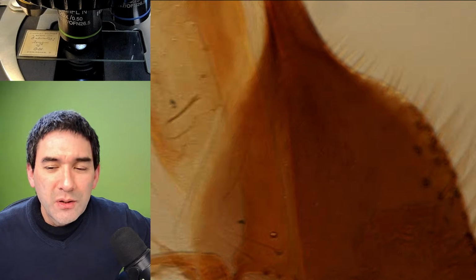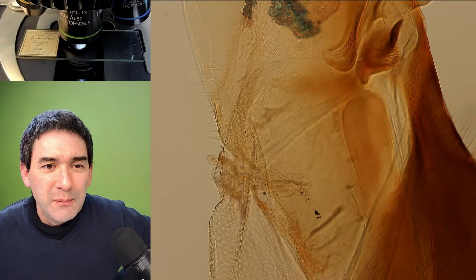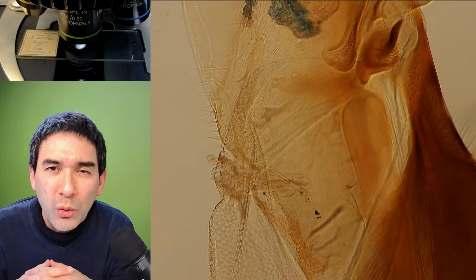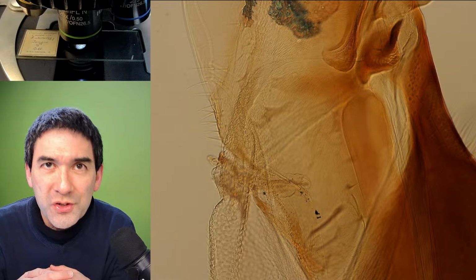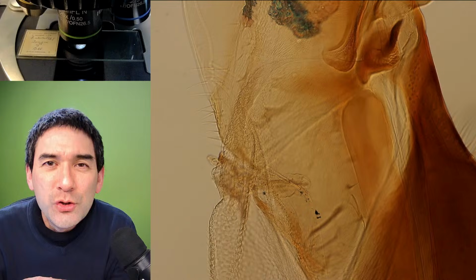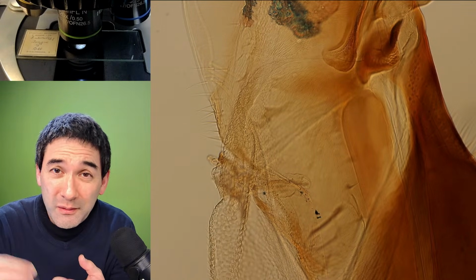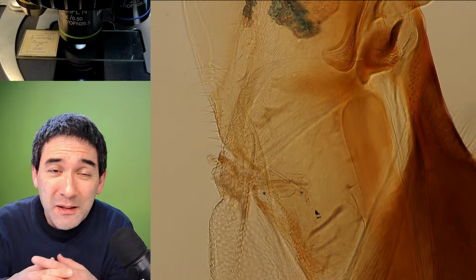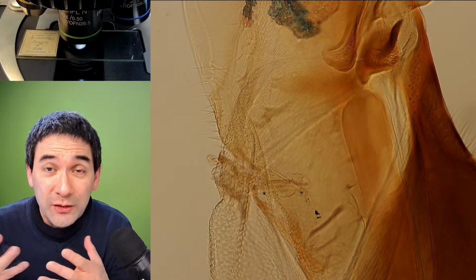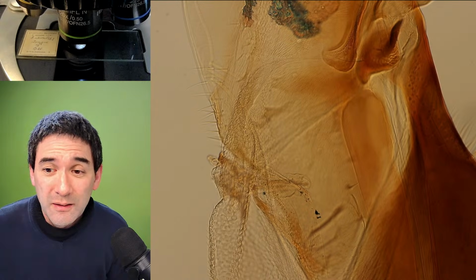It's actually quite interesting because we were talking about some of the more toxic chemicals used in biology. There used to be a solution called Hoyer's solution, and this was used as a so-called clearing agent. Basically, if you had very dark and dense specimens, you added this solution, and it kind of cleared the specimen. There's only one problem: this solution was very toxic and acted like a drug. However, back in the 19th century, people used these things.